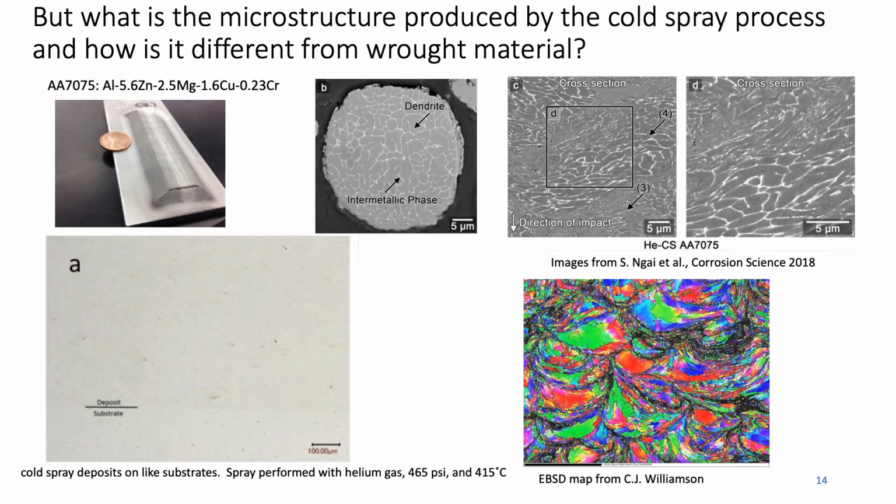Okay, so that's great, but let's go back to the fundamentals. We decided that there was a lot of fairly violent, very fast things going on. There's a lot of application space, but in many forms of engineering, our ability to apply the technology has outpaced our ability to understand it. So we're trying to catch up and understand what's going on here fundamentally. And as a metallurgy researcher, I'm interested in how the cold spray process affects the microstructure of the material produced by that process. And of course, ultimately, how does that affect its mechanical and corrosion behavior?